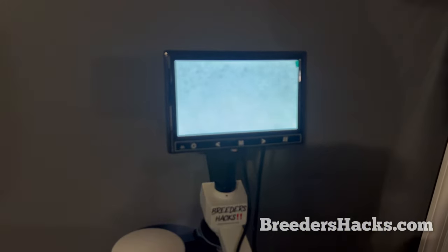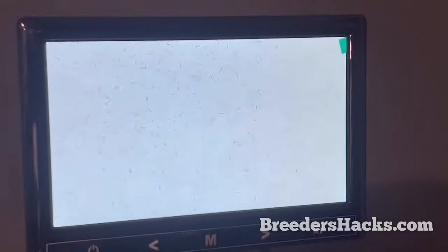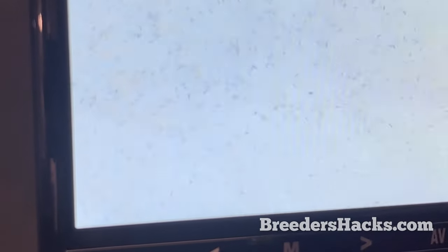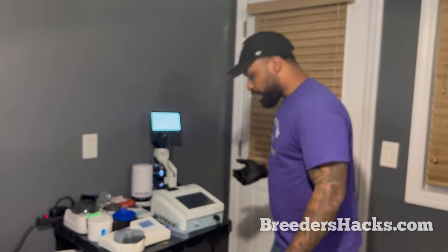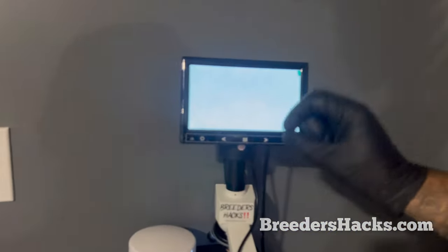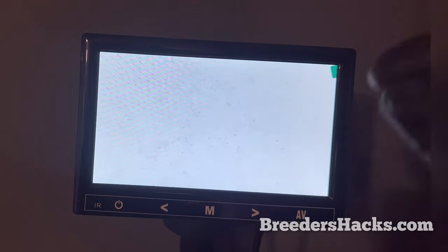I'm gonna focus in real quick, and there we go. Look at that. Sperm cells going crazy all over the place. Now, the trick when you're looking at sperm cells under the microscope is you want to look, and you can have them look, come show them. You want at least 3/4 of what you see on the screen to be motile, moving.